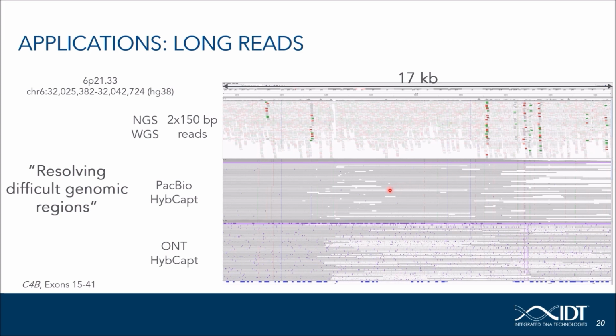Variant detection in areas with low mapping quality is particularly difficult and may be significantly biased by mismapped fragments. On the other hand, long and accurate PacBio reads have no problems anchoring to these unambiguous areas and thereby spanning and resolving difficult-to-sequence regions. Some Oxford Nanopore reads also do not map uniquely to their genomic location. However, there are always enough uniquely mapping reads left so that the variation in this area can unambiguously be elucidated.